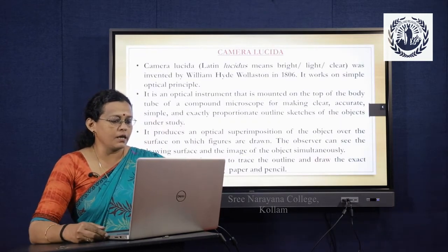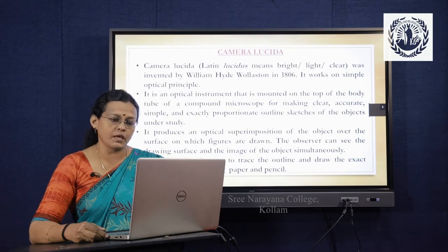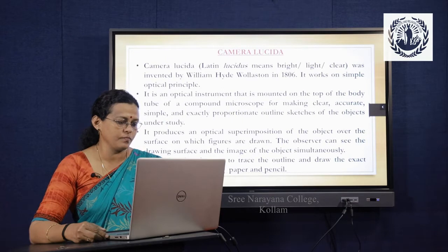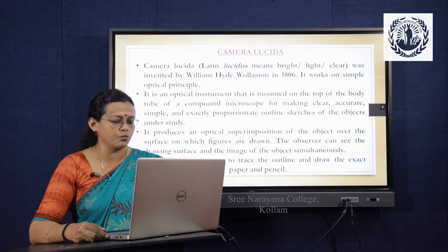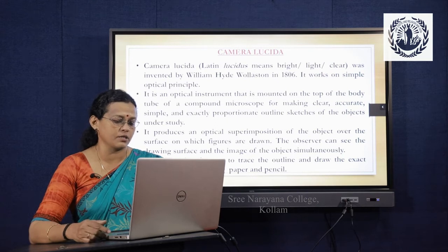The term camera lucida derives from a Latin word, and the term lucidus means bright, light or clear, and it was first invented by William Hyde Wollaston in 1806. It works on a simple optical principle. It is an optical instrument that is mounted on top of the body tube of a compound microscope for making clear, accurate, simple and exactly proportionate outline sketches of the objects under study.